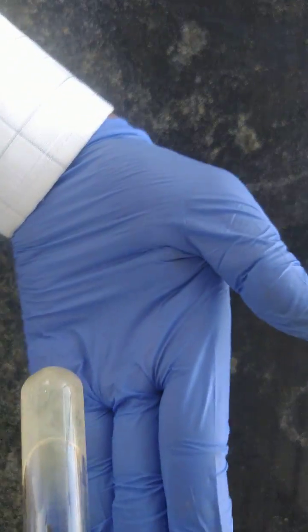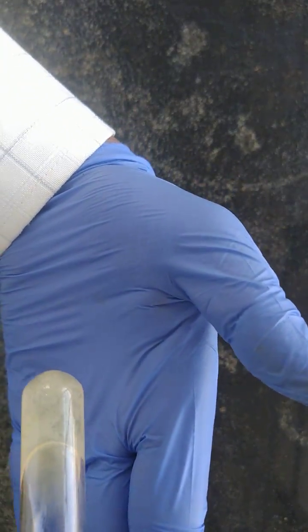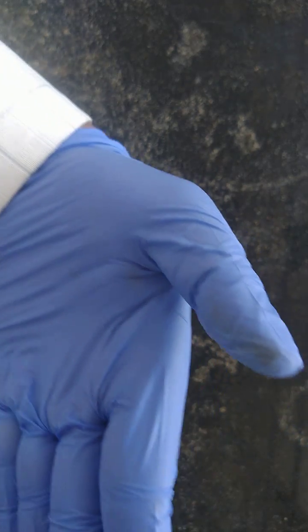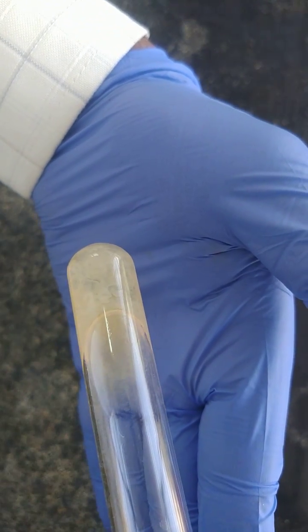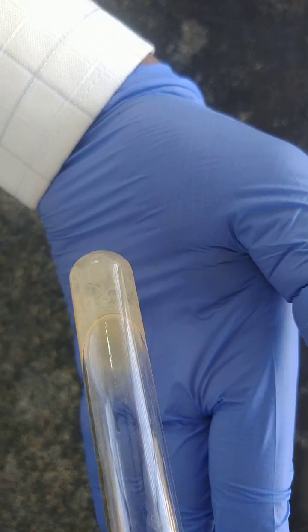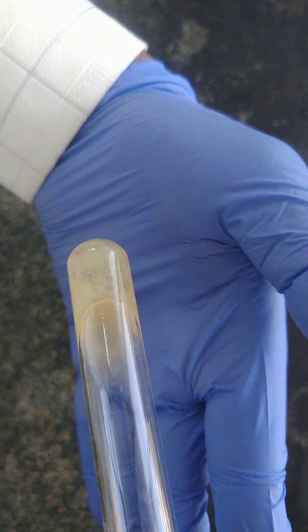You can see the observation here. We are getting initially a white precipitate which is turning brown when it is exposed to air. So the observation is white precipitate turns brown when exposed to air. This gives the confirmation that in the given salt Mn2+ is present.